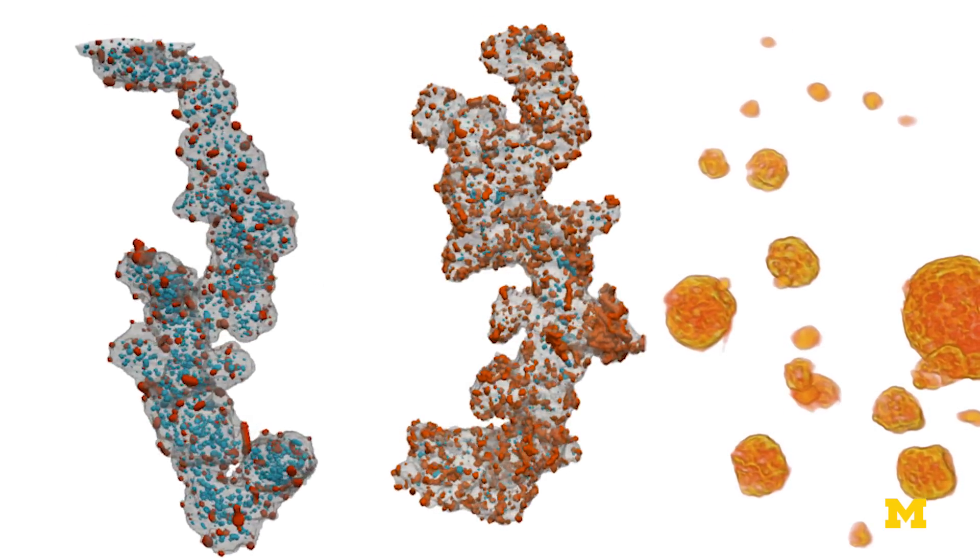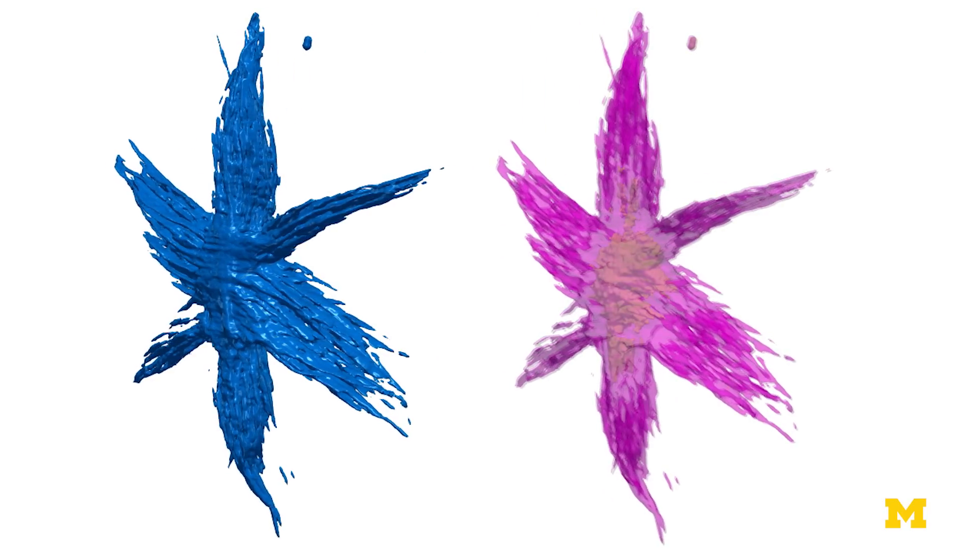It starts with the nanomaterials, so we need to be able to see at the nanoscale all three dimensions. You need to be able to slice through the material, looking at its internal density changes, and do it at high resolution.